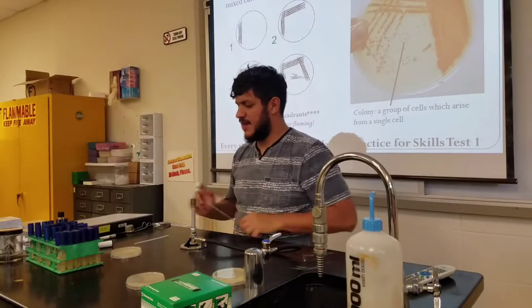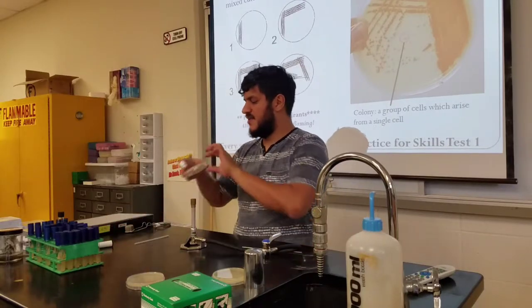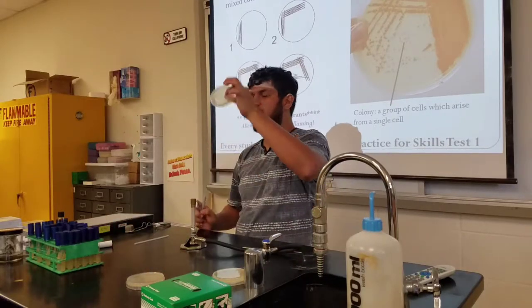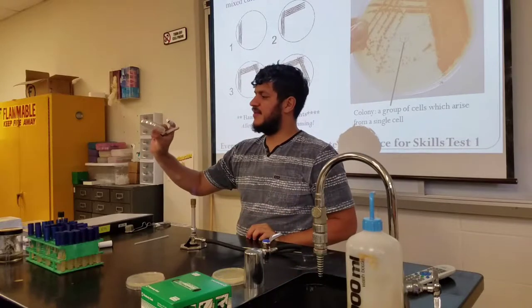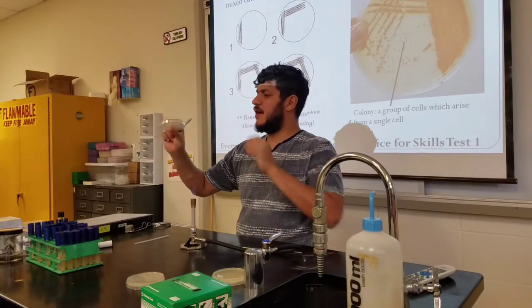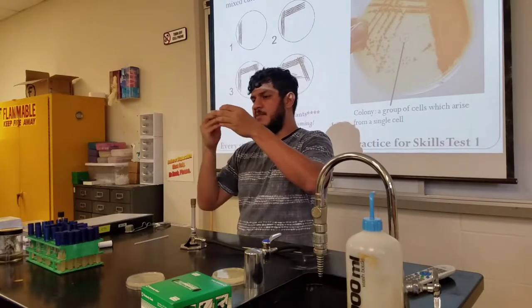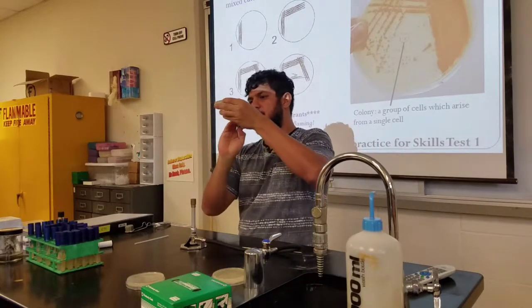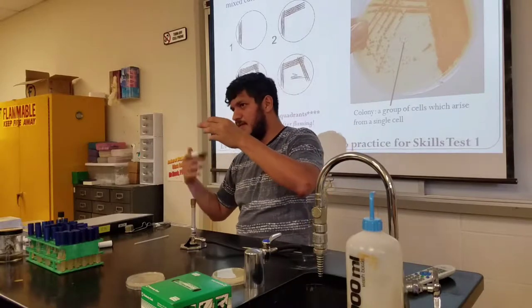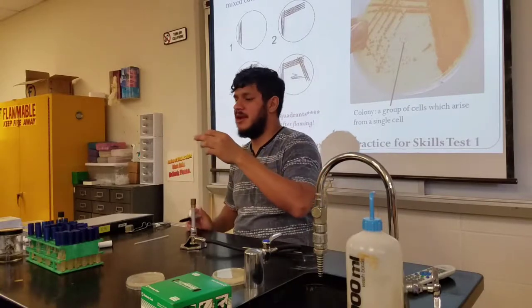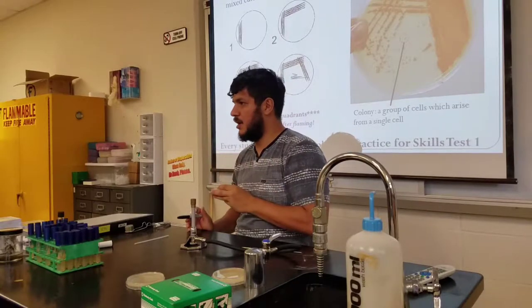Slant to plate transfer. This is the plate we use. The plates are stored almost inverted to avoid condensation and avoid further contamination when we incubate microorganisms.